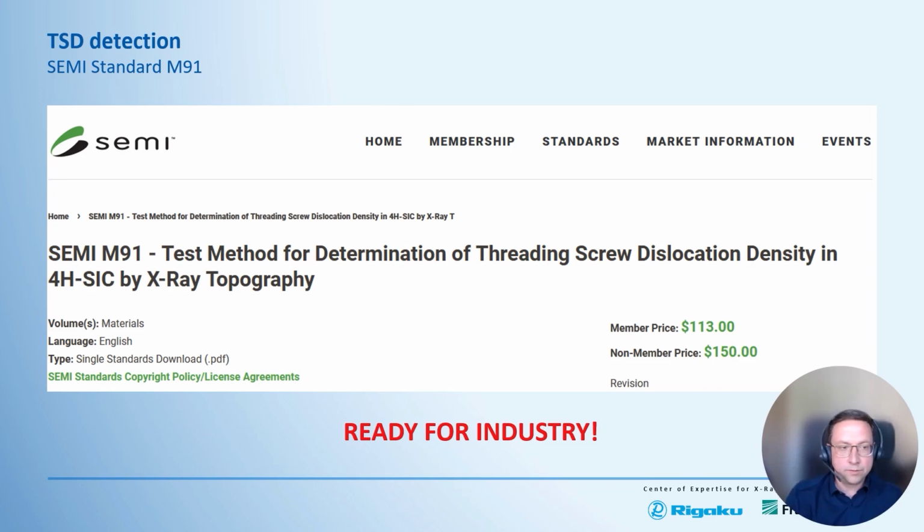This knowledge was collected together and compiled into a semi-standard M91, which is now ready for industry and gives the possibility, really a guideline or a new language, to the whole community to measure threading screw dislocations in silicon carbide by using X-ray topography.